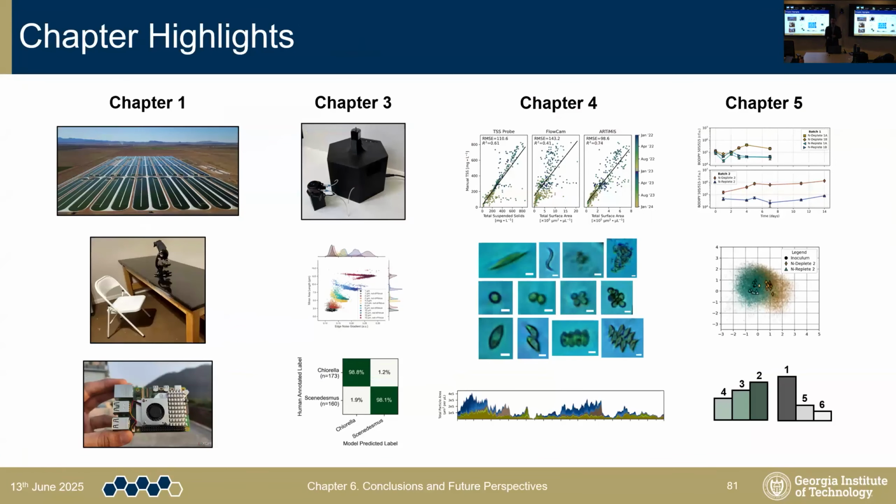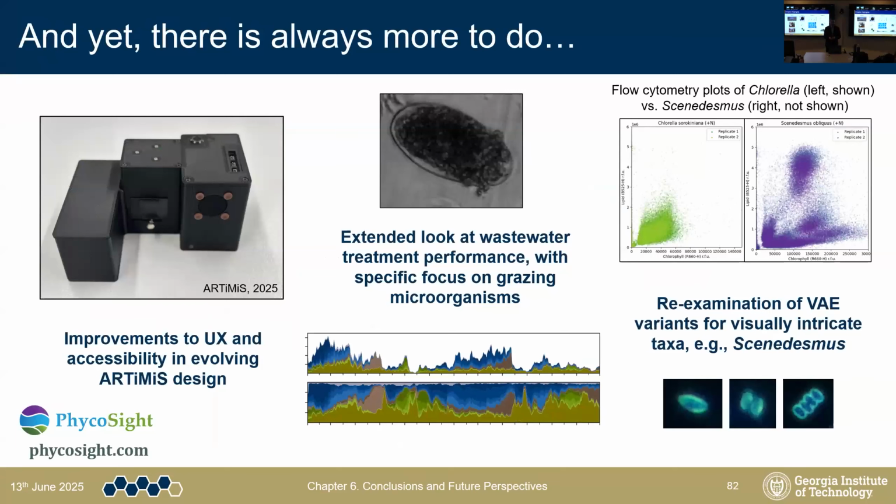All right, so just a visual overview of some of the chapter highlights that we covered. We talked about algae being a really important crop and some of the ways that you can measure it. We talked about why ARTiMiS was developed and how we validated it. We talked about a really interesting demonstration of ARTiMiS over a long time series. And we talked about some novel ways that we can try to determine phenotypes on a very affordable scale. So without dyes, without complicated workflows.